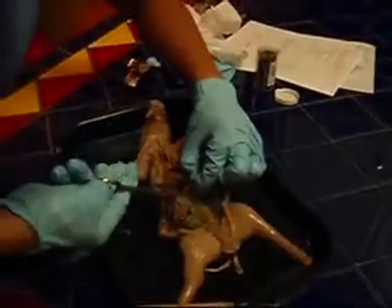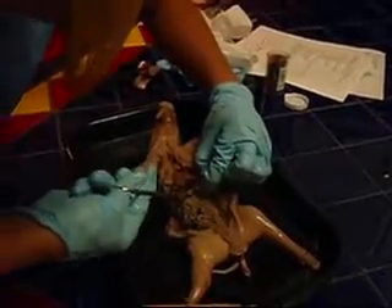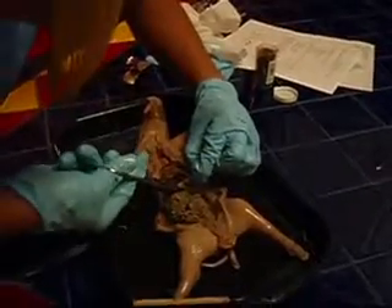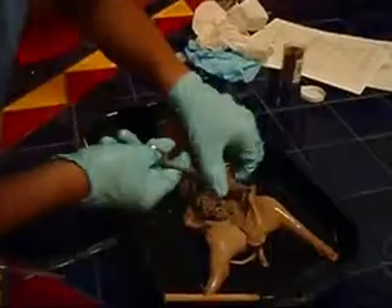There are two important valves in the stomach: the cardiac sphincter, which is located at the anterior end, and the pyloric sphincter valve, which is located at the posterior end. These valves open and close to allow food into and out of the stomach.